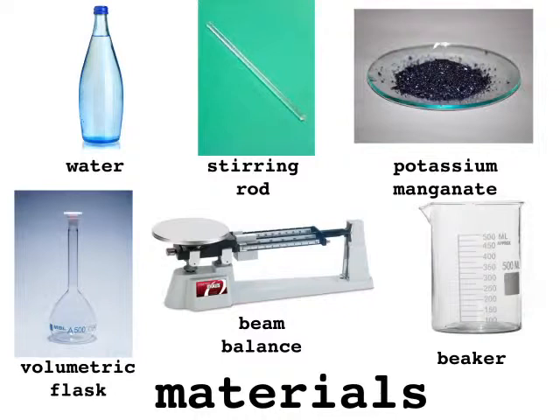We will be using the following apparatus. A chemical balance for measuring the mass of the solid. A watch glass to hold the solid while measuring the mass on the chemical balance. A beaker and glass rod for mixing the solid and liquid. And a volumetric flask for measuring the volume of the solution.